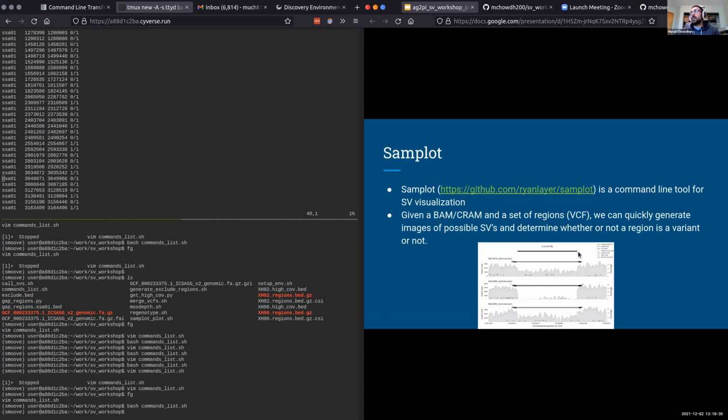And the SV that was called in this particular case was some sort of deletion with the breakpoint spanning this region here, which we can kind of see just from the dip in depth of coverage from these 3 samples. So for example, this plot is essentially what looks like a heterozygous deletion or 1 copy loss. This looks like a homozygous alternate deletion, which is essentially like a 2 copy loss. And same thing with this, it is another heterozygous deletion.